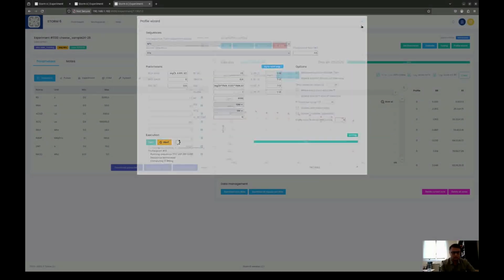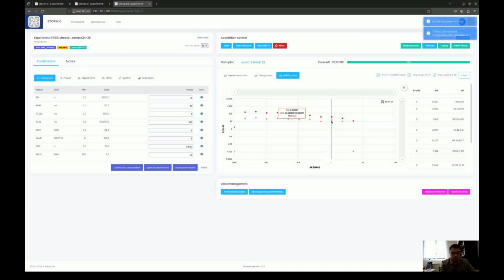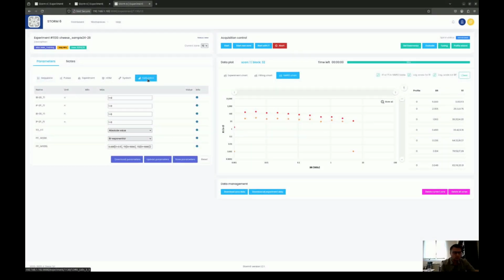So we can see here that at higher field both components are more or less in the same range, but as we go down the component values increase, and now with these values it's up to the experts and analysts to see if these values they are getting are okay, or if they need, they can also tune these values, play with this model to get the behavior which is most approximated and expected.